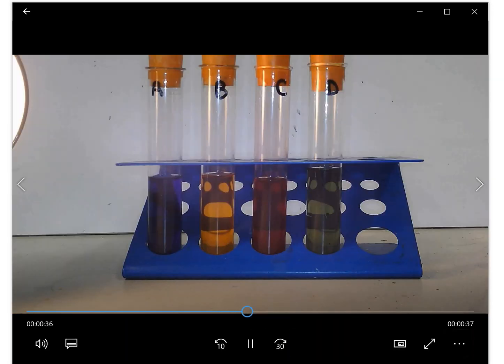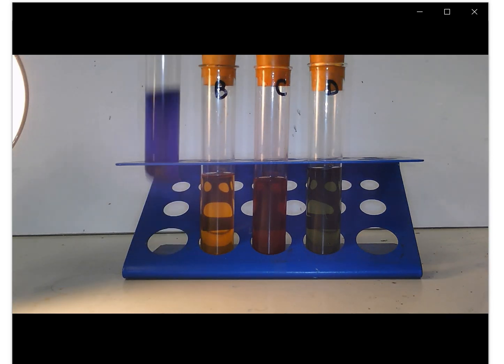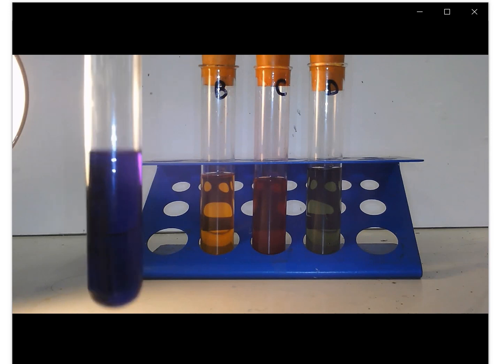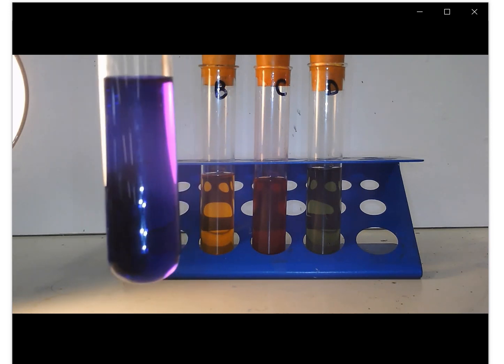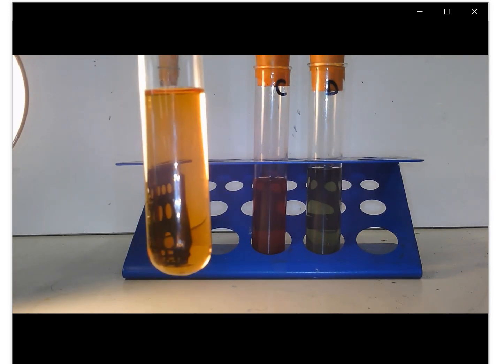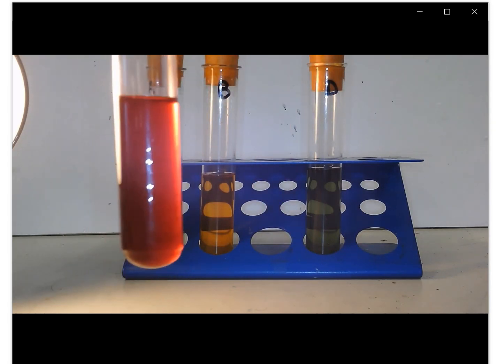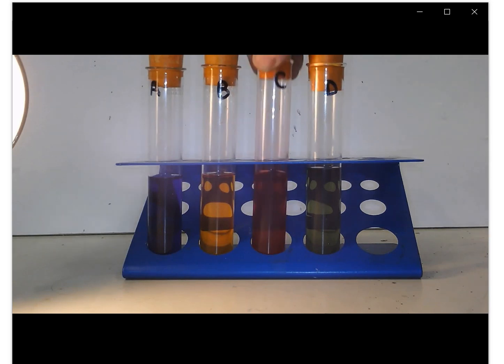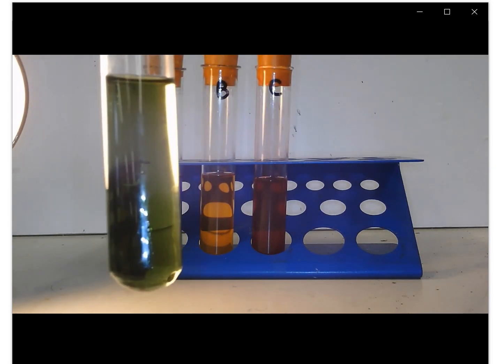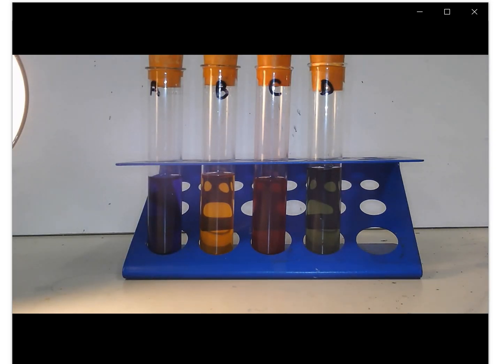And here you can see the results. I'm going to bring each one close up to the camera so you can see it more clearly. So there's A. Nice purple shine to it there. B. It's an orange yellow almost. C is red. And D is a dark green. So make sure you record those results.